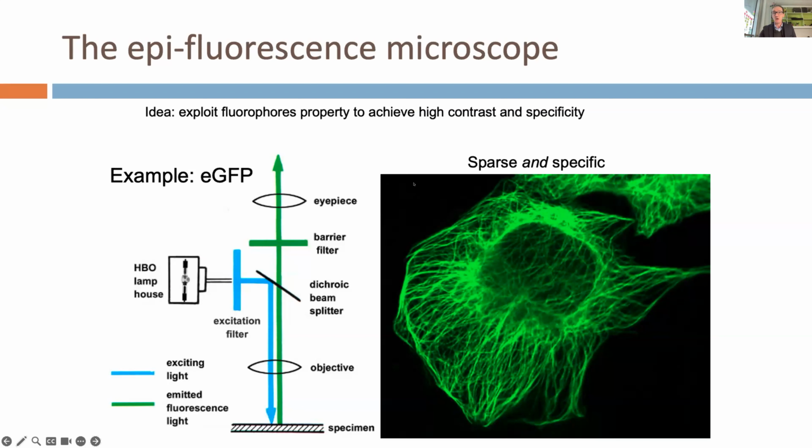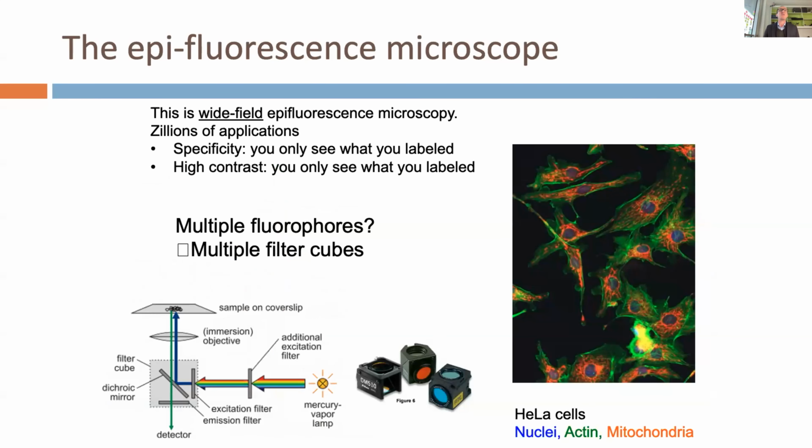Now, this is important. The majority of pixels are black, and the intensity of light actually encodes the concentration of the protein, right? So this is especially interesting for us, and it fostered the interest of people like me, coming from physics, who are interested in quantitative imaging.